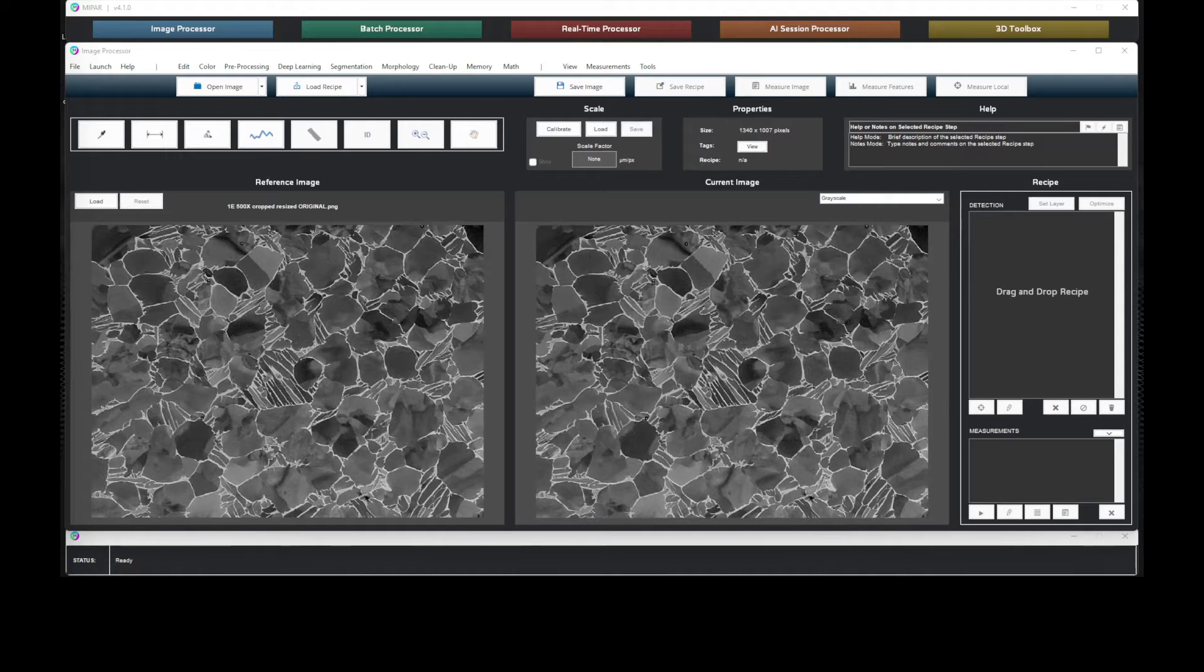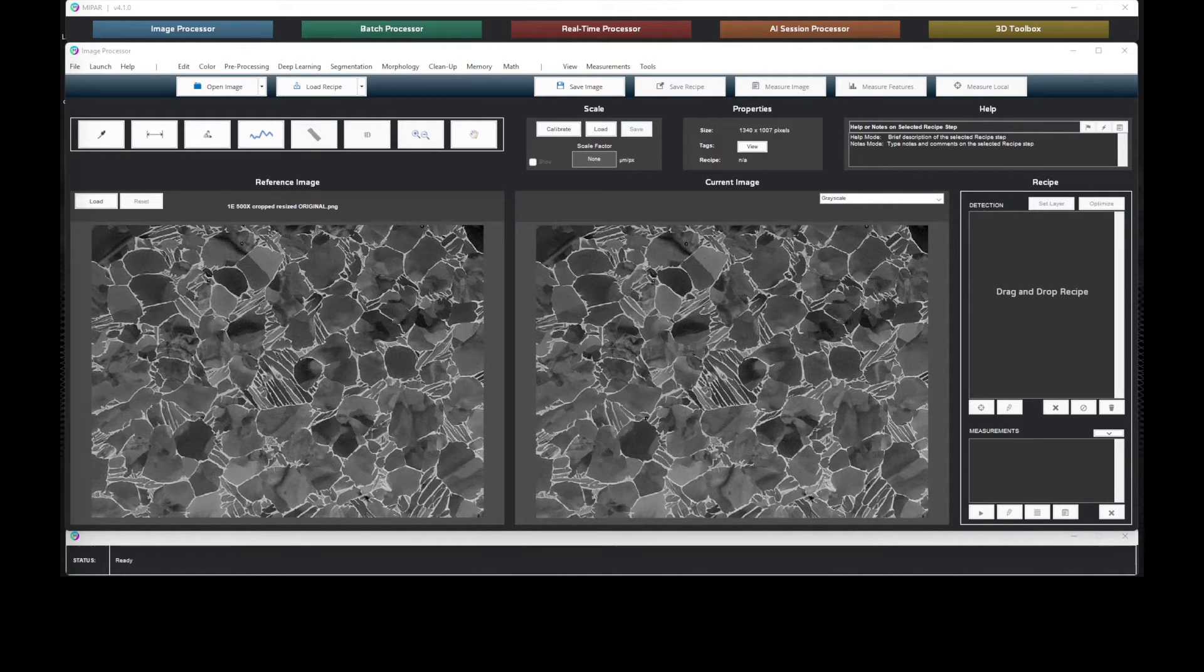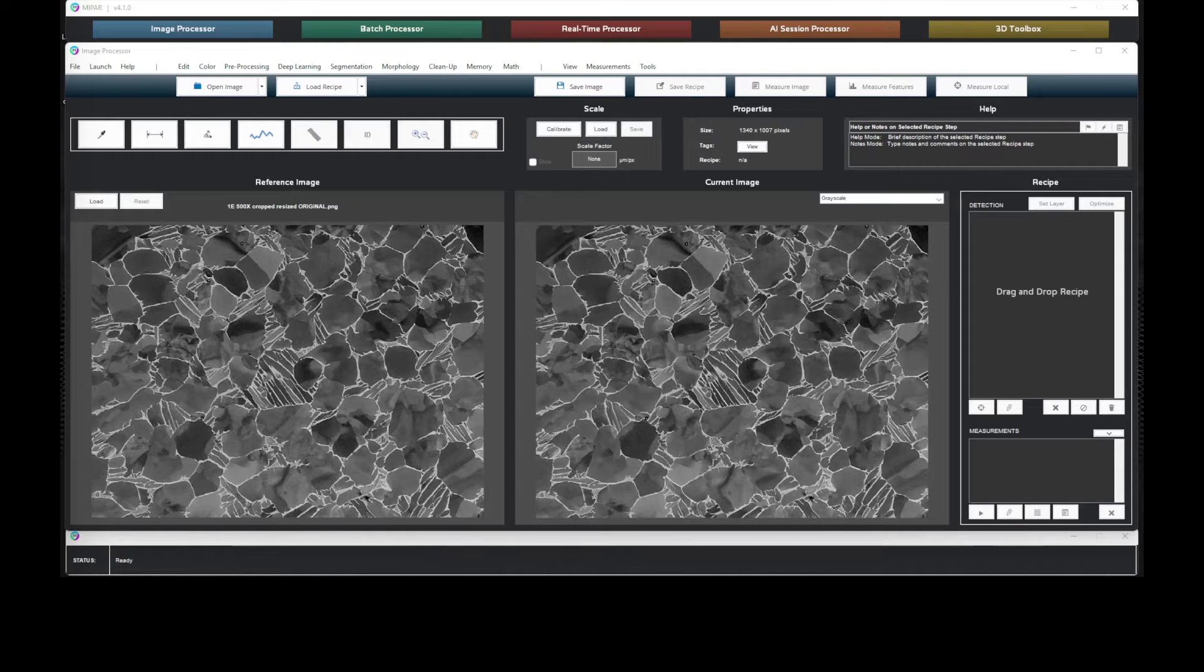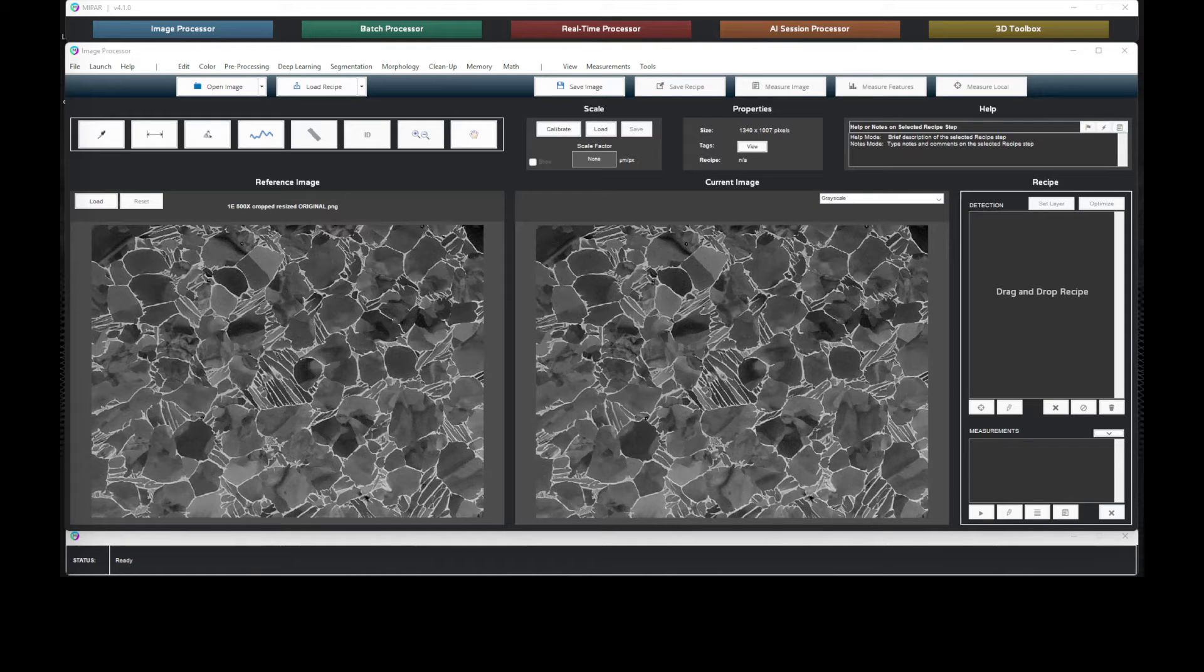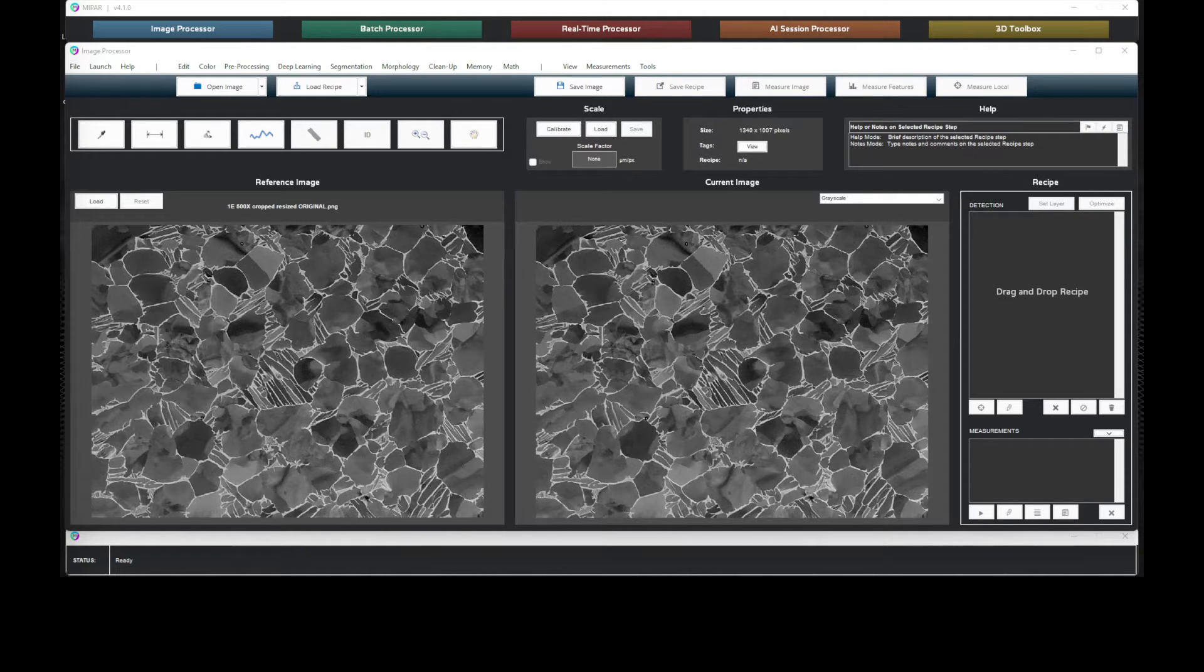When performing characterization of titanium alloy phases, EM data can pose challenges due to variation in noise. We can see how the beta phase in this sample expresses significant grayscale variation.